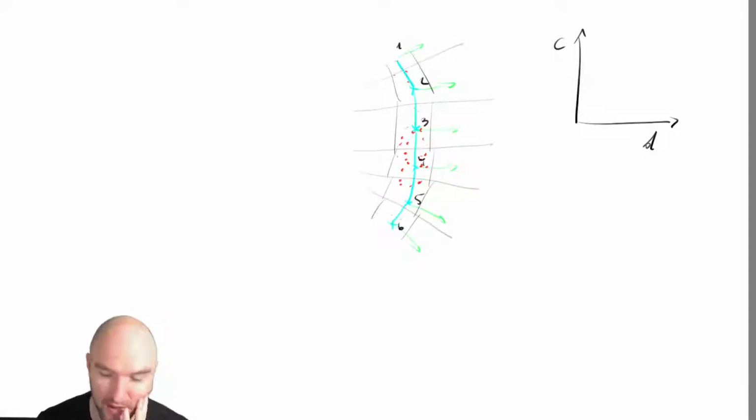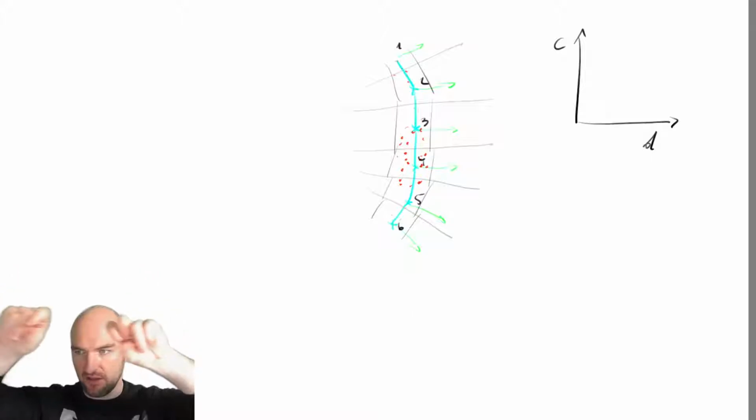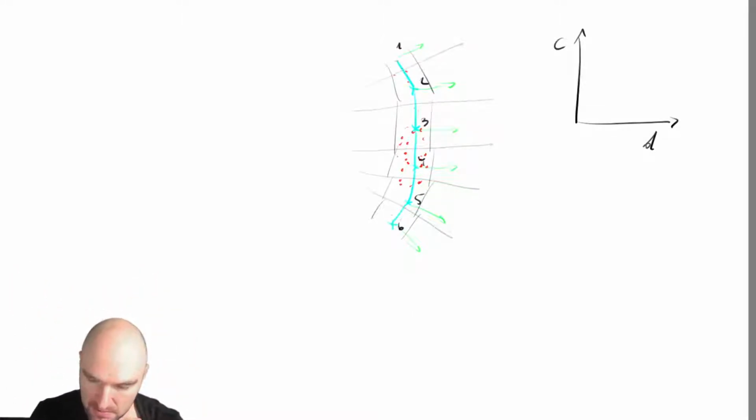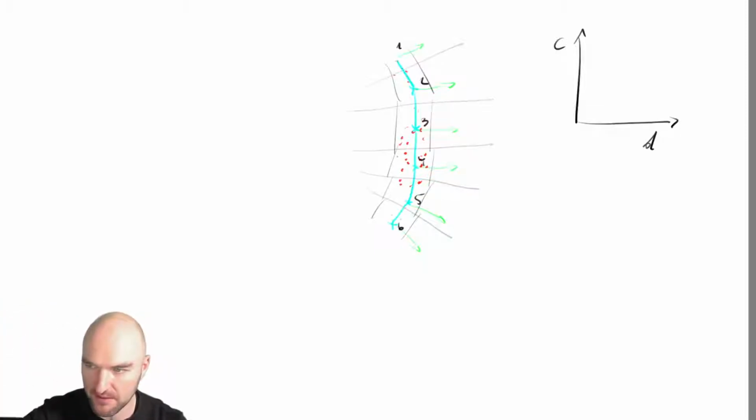Yeah? That's not a big problem, because we can use the distance to the closest vertex as one coordinate, and the vertex number as one coordinate. The reason why that is not super practical is because unless you have an extremely flat surface where you can just have a rectangular interface thing that you put in, the vertex indices of neighboring vertices are not necessarily in incrementing order. Yeah? I mean, that's just not possible in 2D, and even less so in curved 2D. Yeah? So anyway, this is the basis of everything. And let's get cracking with that.